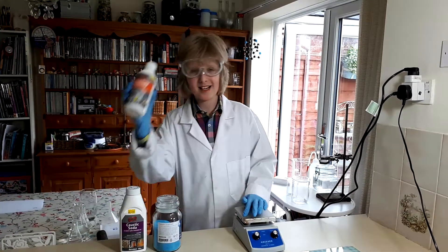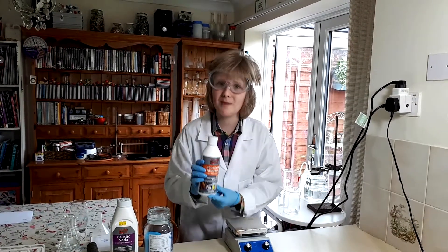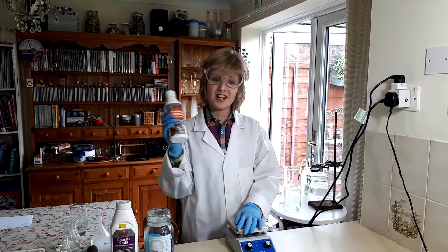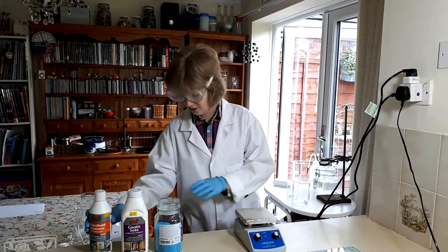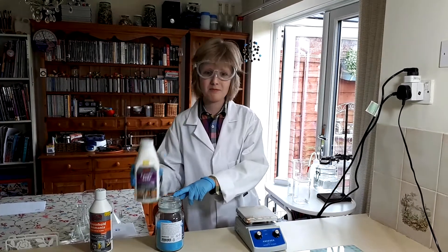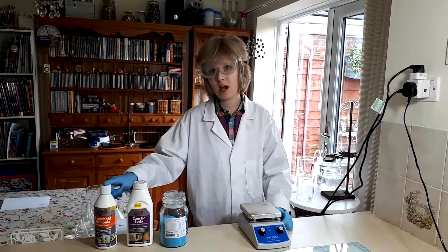You also need some ammonia. Do not omit this, however horrible the smell is. It is required for making this, and if you just add copper sulphate to sodium hydroxide it's really weird because it turns slimy green black. So do not omit this at all.